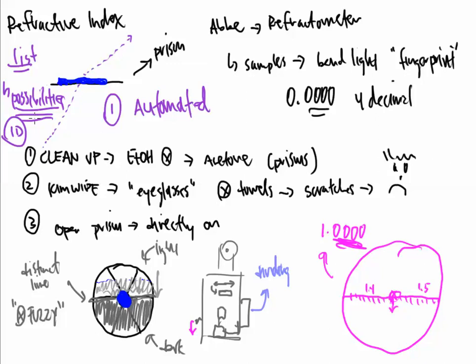And really, that's kind of the onslaught of the physical property labs that you will see. In the upcoming lab, what we will do at that point is we will combine everything together. So we will make you do a boiling point or melting point, we'll make you do a density measurement, we'll make you do a refractive index measurement, and you will pick out what compound it is from a massive table with many different physical properties that are located on it.